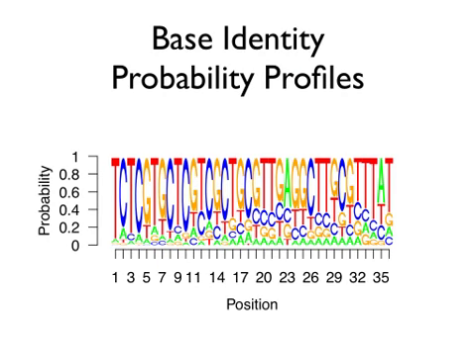And then the other thing you can do is you can estimate the deltas, and instead of calling, you can actually report the probabilities for each of the 4 deltas. So in the first read, T has about a 90% chance of being true, the 1, and then C, A, and G are very unlikely. So you actually get like a probability profile for each base.